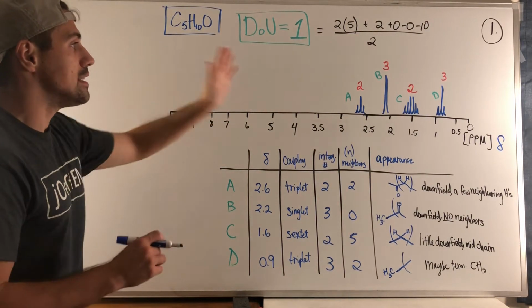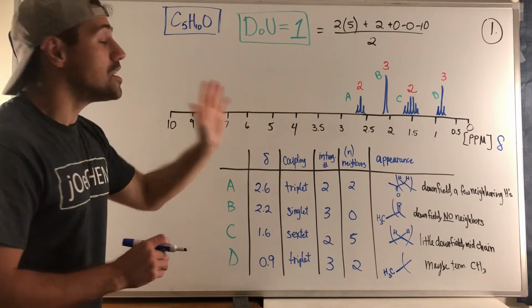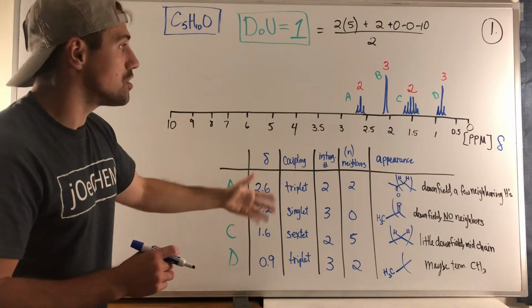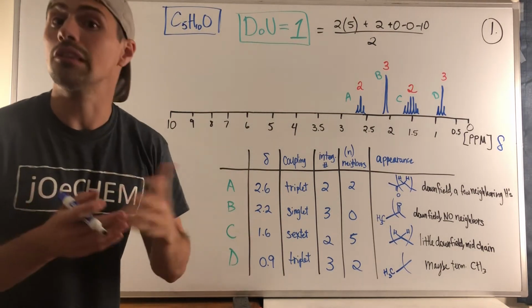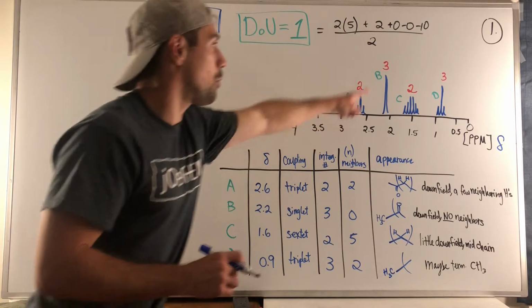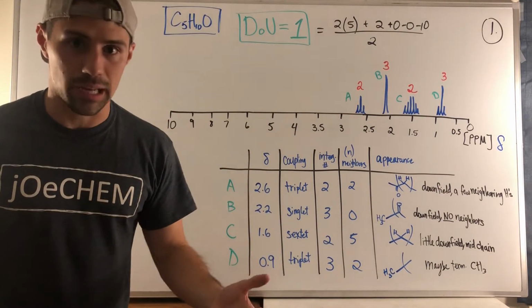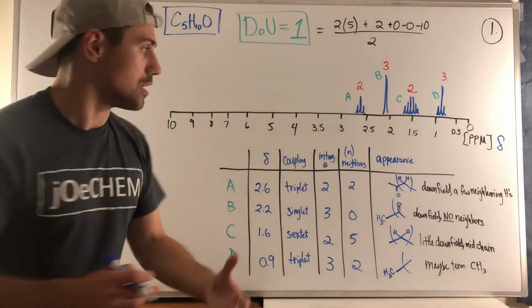So we're going from downfield back upfield. B is downfield as well. Chemical shift over 2. I probably drew it not so great, but I was aiming for something in the low 2s, around 2.2. It is a singlet and has an integration of 3. We see the 1 peak, so it's a singlet. The n+1 rule means we don't have neighbors. These hydrogens aren't splitting with any other hydrogens.